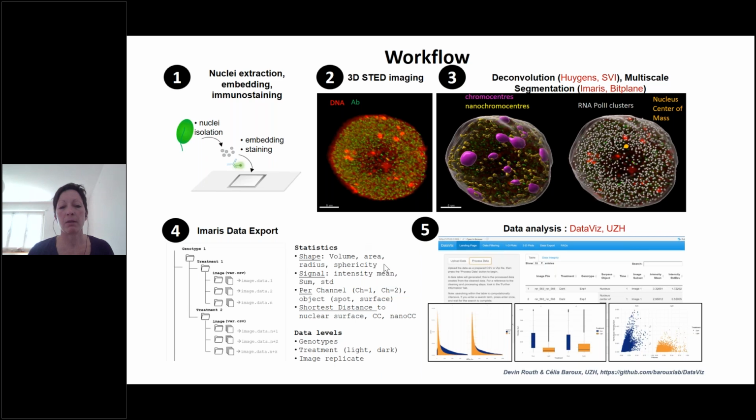I have to admit that up to a year ago, we were really stuck with this huge amount of data, and we thought, well, we can just write a script in R or a script in Python and we plot things. At that stage where we thought it's really complex, we realized scripting is not really a nice option, because to explore your data, you always need to write a new line of script.